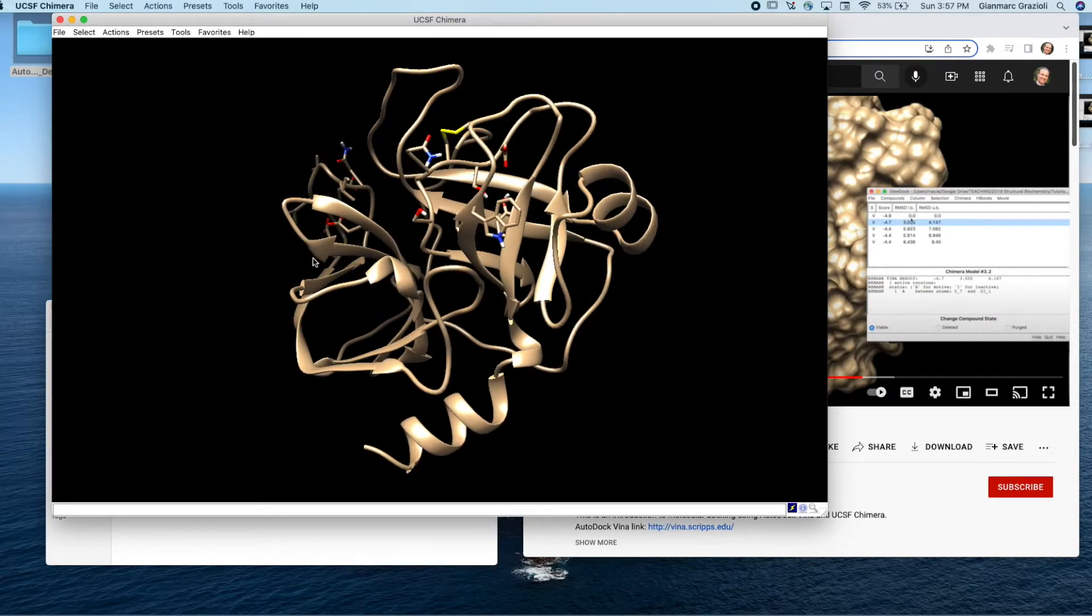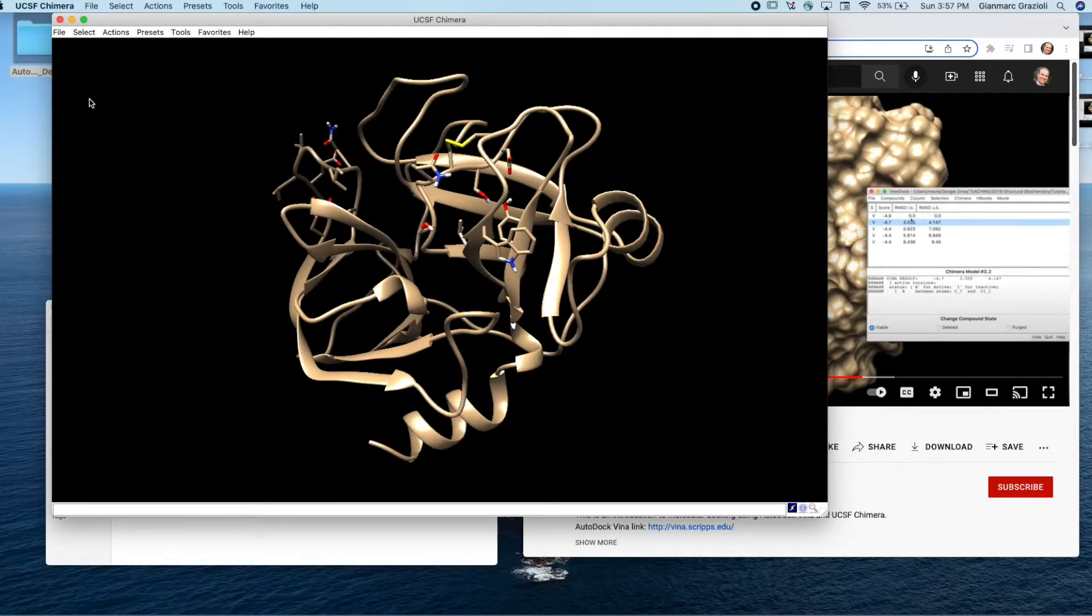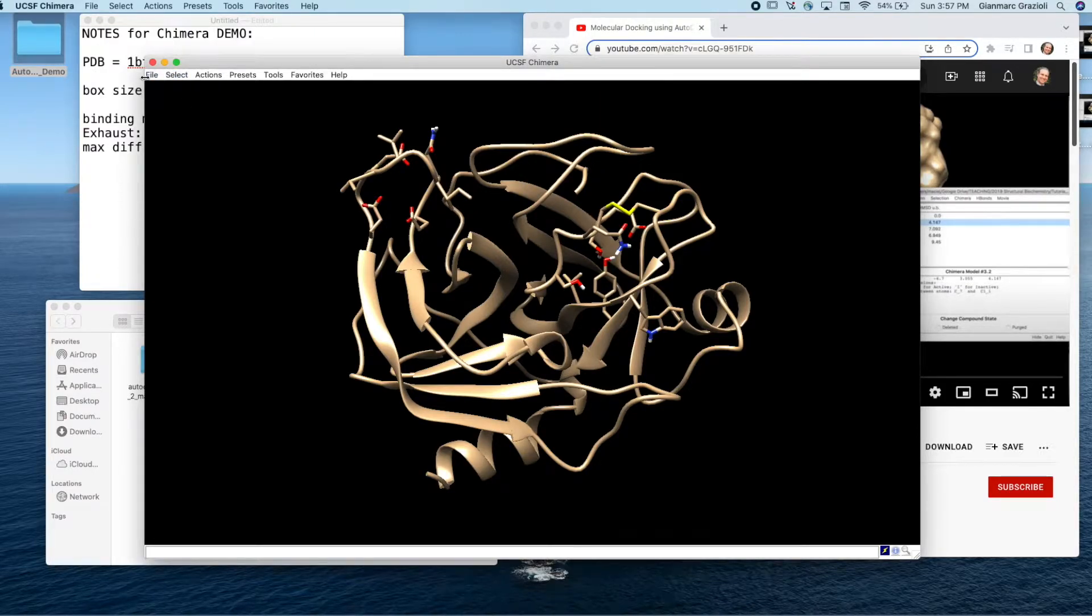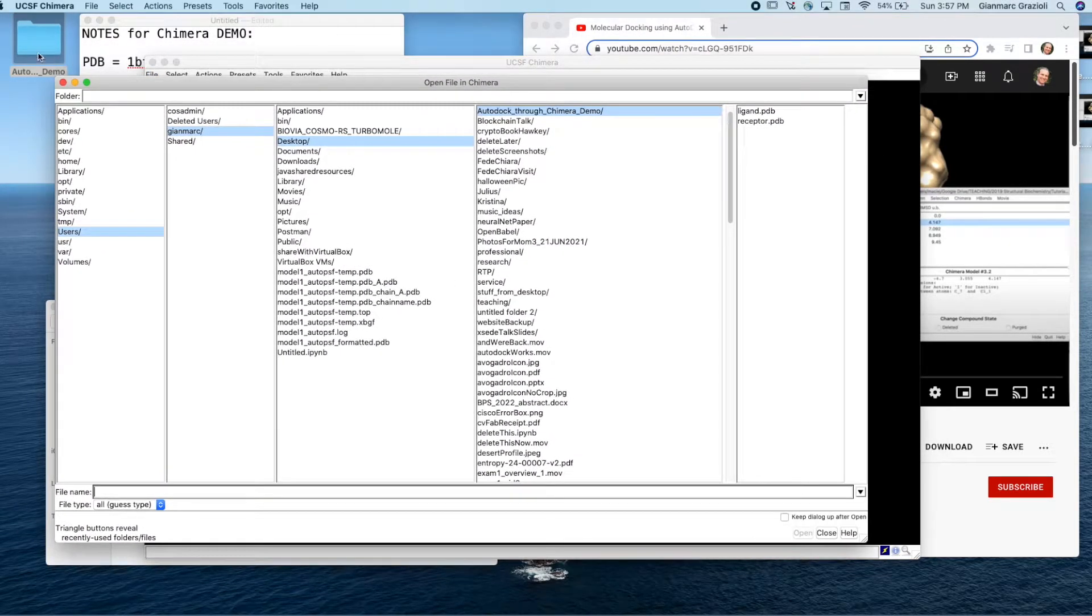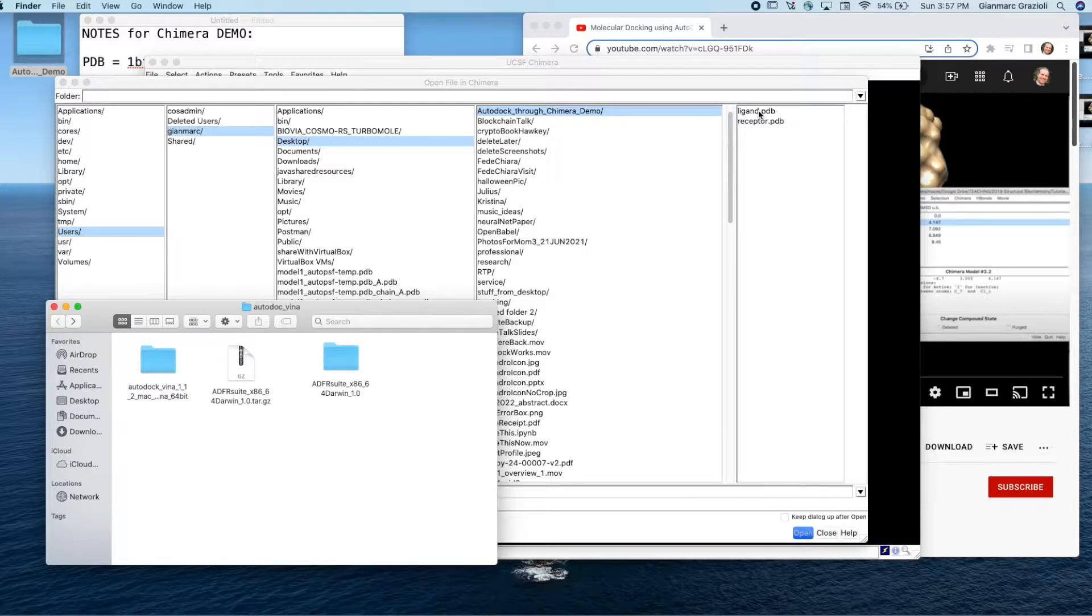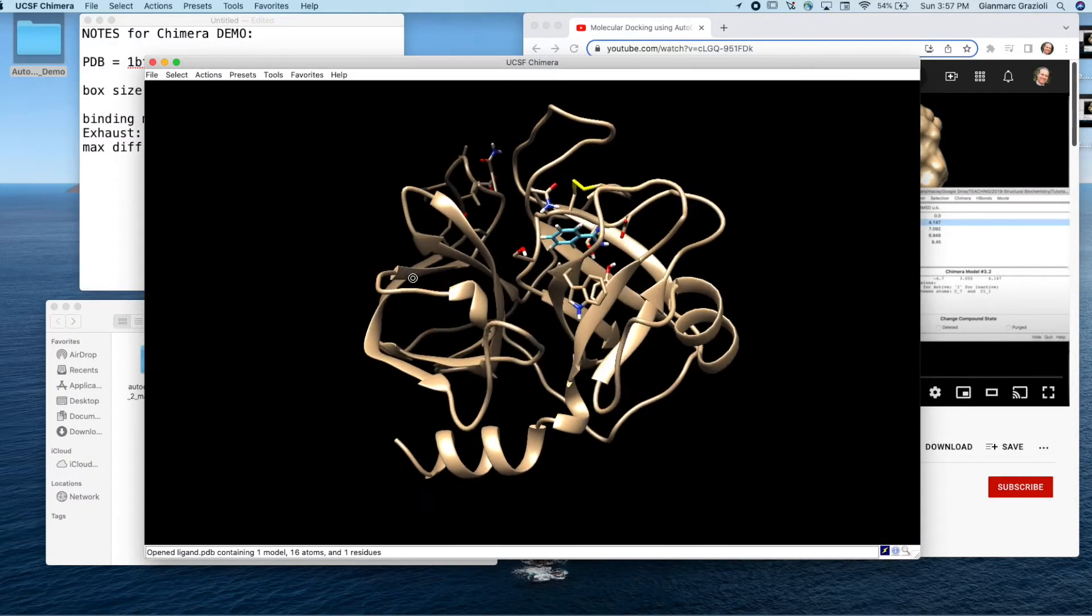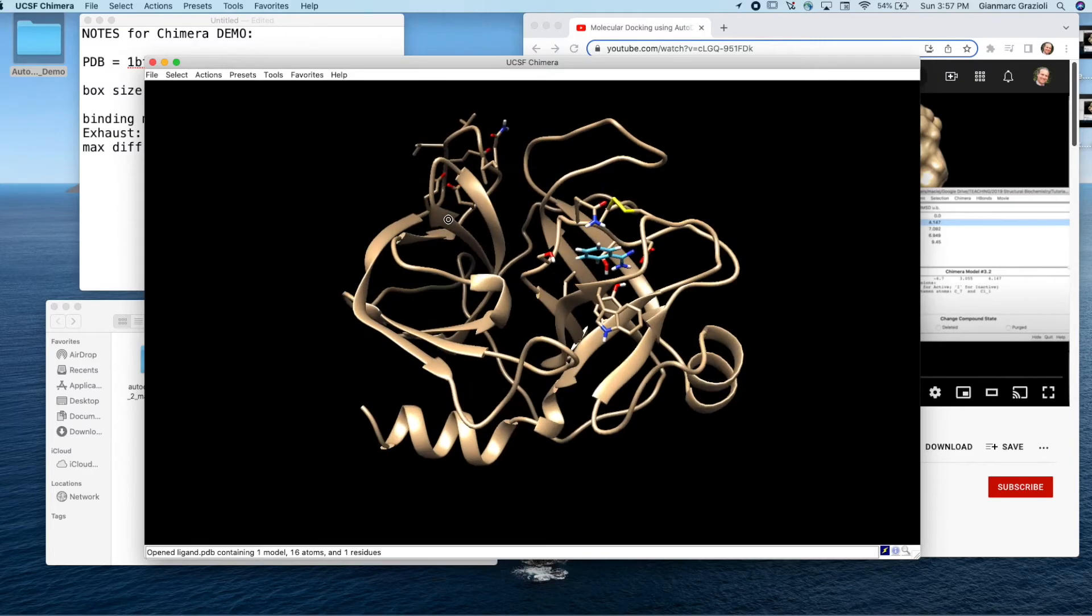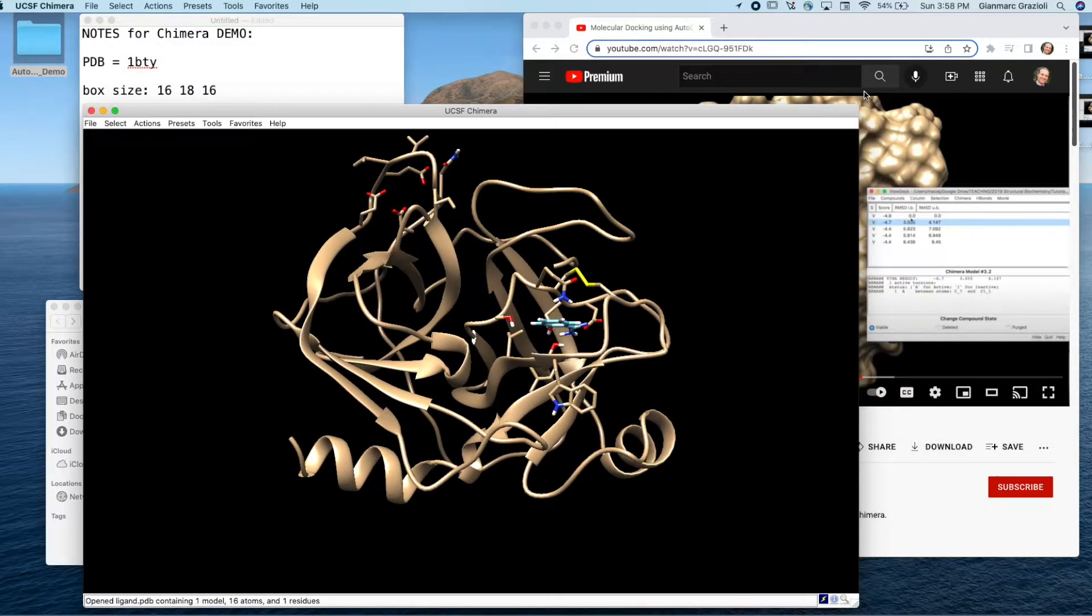And now we need to have both things loaded here. So we want to also load the ligand. Let's load the ligand now. If we go file open, we're still in the same directory, this one on the desktop here. We are going to load the ligand, say open. And then there it is. You see it's shown in a different color. So now both are loaded, both the ligand and the target or receptor are both loaded in here.